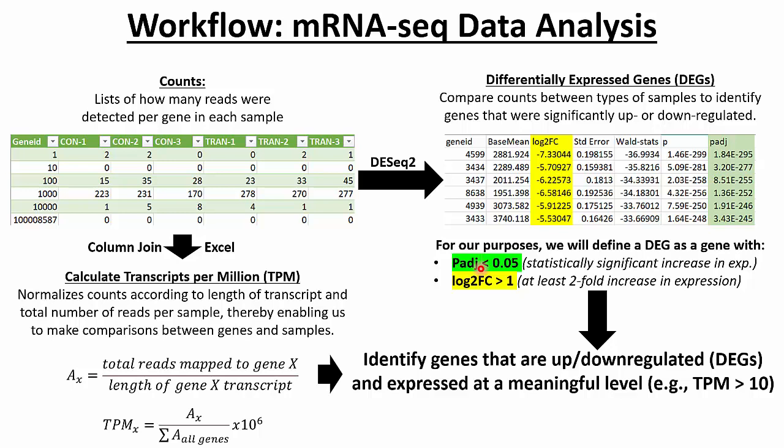P less than 0.05, but it should also have a TPM that's expressed at a meaningfully high level. So something greater than 10 usually is what we say, although that's definitely an arbitrary threshold that changes between users and experiments. Okay? But there you go. These are all the wonderful things that Galaxy can give us.